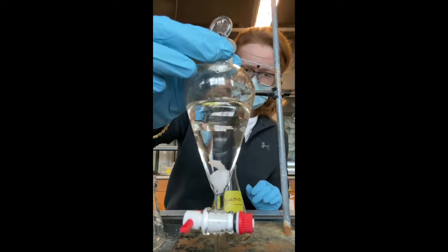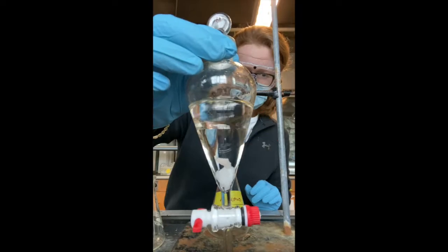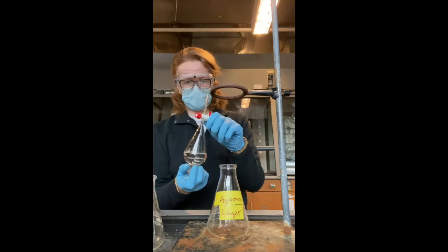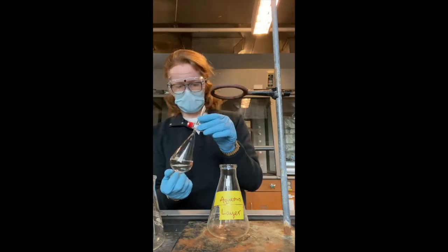I am showing you the separatory funnel, and if you look closely, you can see the solvent hexane is on top of the mixture of water with benzophenone, as it is less dense than water. Now I will begin the extraction process, but first you need to open the stopcock to release any pressure that is built up inside the separatory funnel, and close it after.